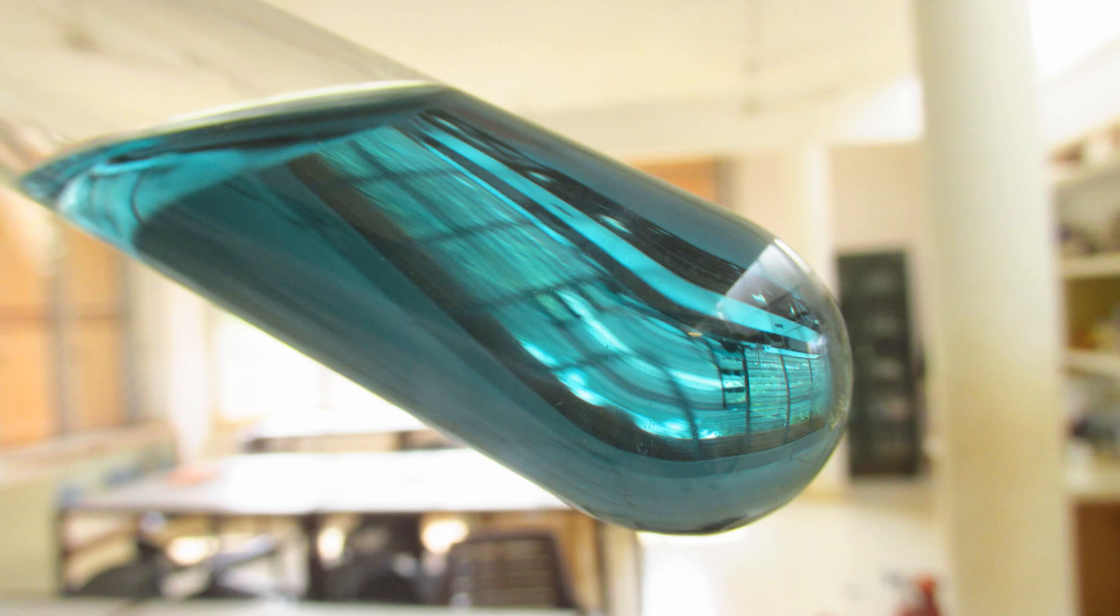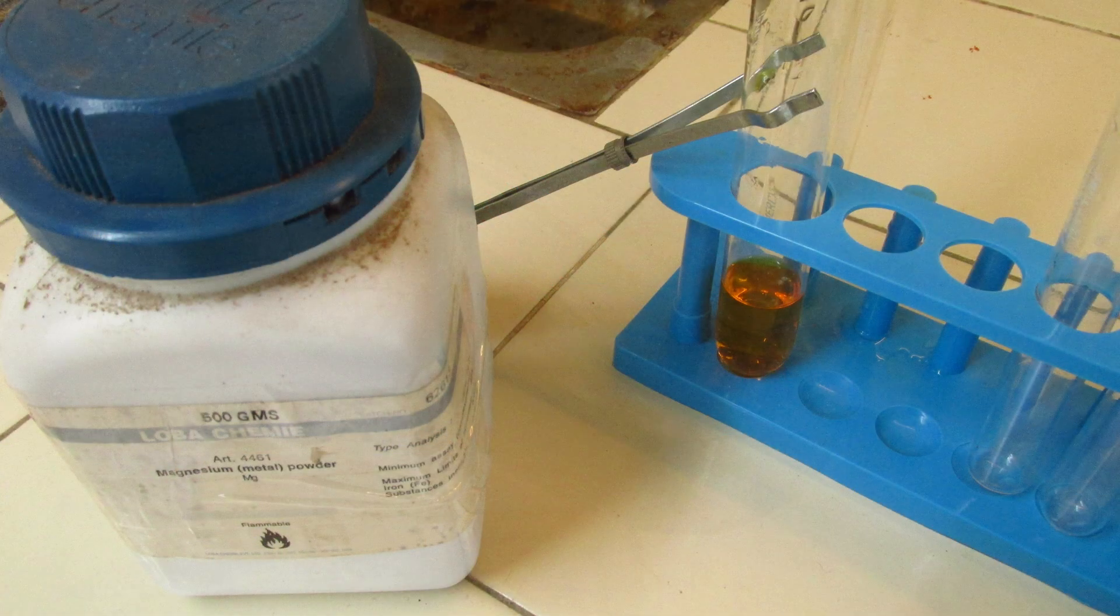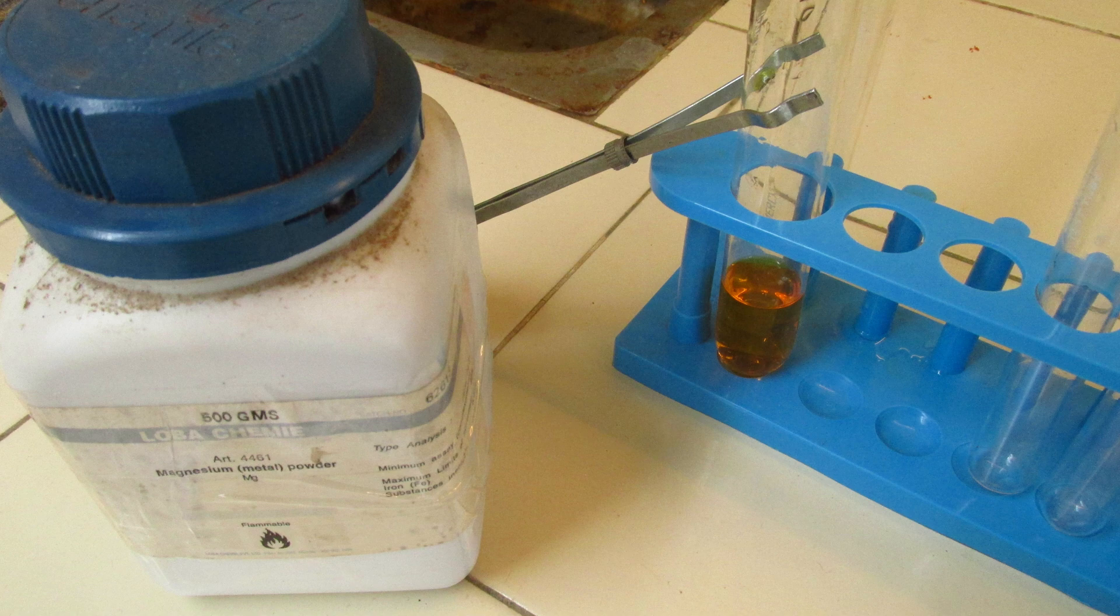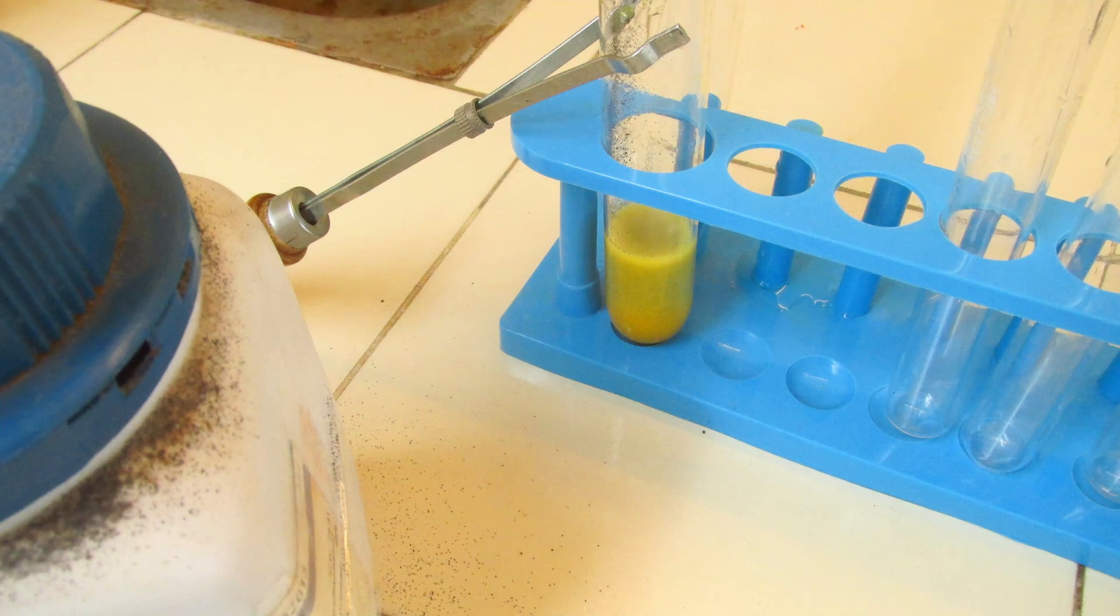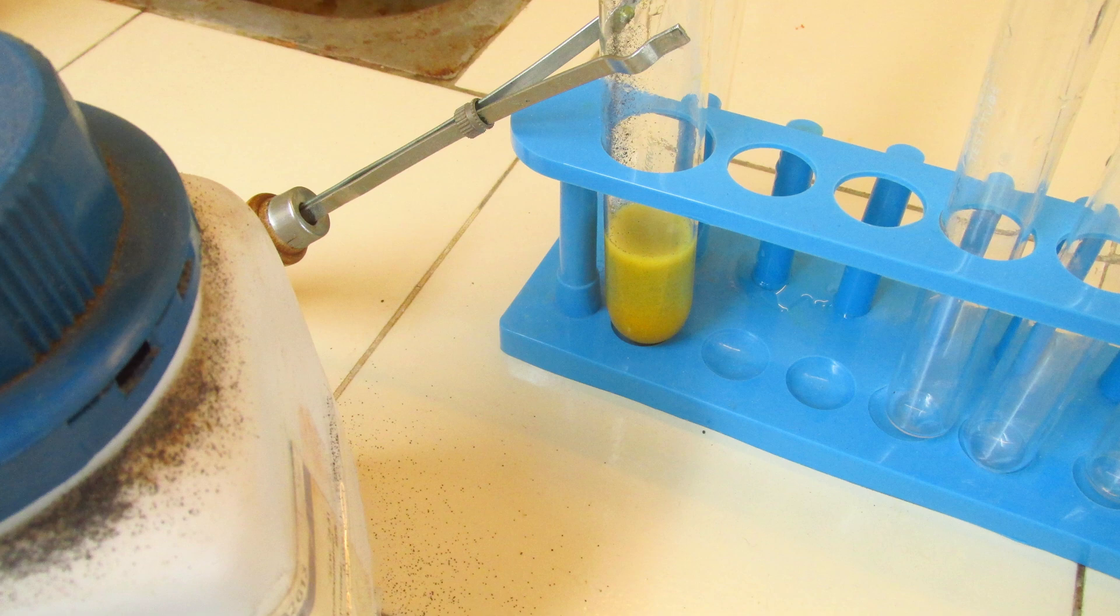Okay, let's play with some other reducing agents. Here I'm trying to add magnesium powder to my acidified potassium dichromate. Here you see what happened. It bubbles. It bubbles because obviously it reacts with sulfuric acid, which is there in my potassium dichromate 6 mixture.